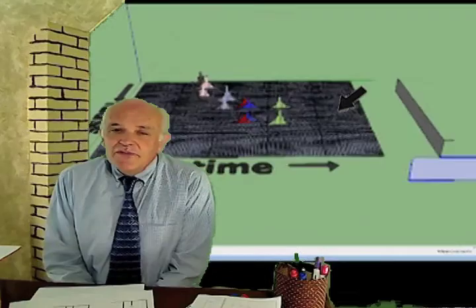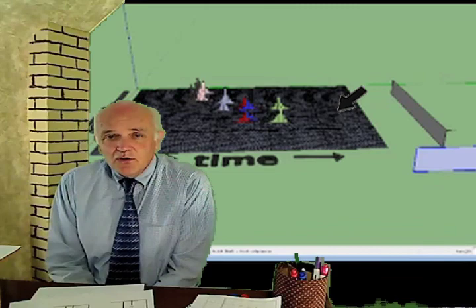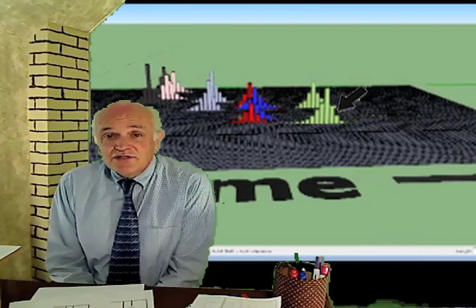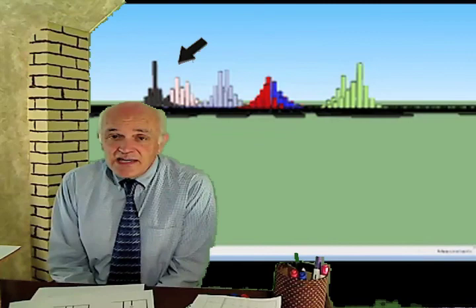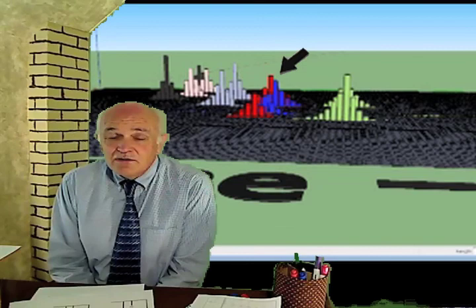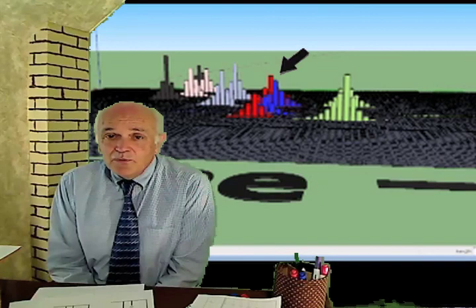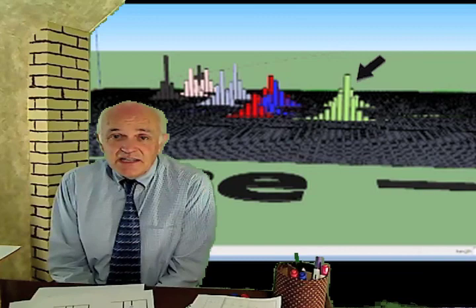The total ion chromatograph is the overall gas chromatography. It would be analogous to the FID for regular GC. It's kind of like the regular GC application. And you can see it from this side. You can see here we've got two peaks that are close but not the same. And then this one is by itself. And then the 2-methyl and the 4-methylphenol, again, are close, but they're not the same. The 2-methyl and the 4-methyl do not coelute, but they're close. And then the 1,4-dichlorobenzene D4 makes a nice even peak. You can see the chromatogram from this side.